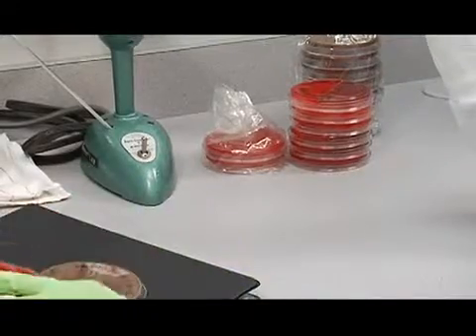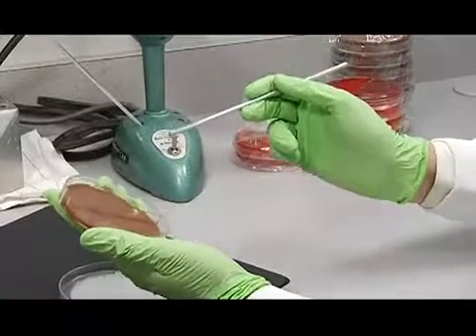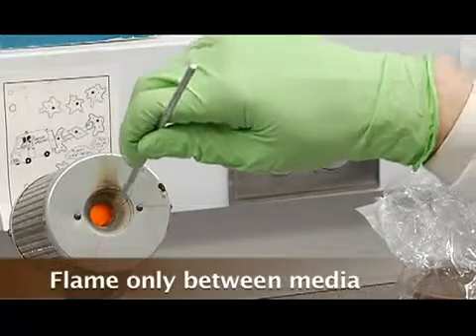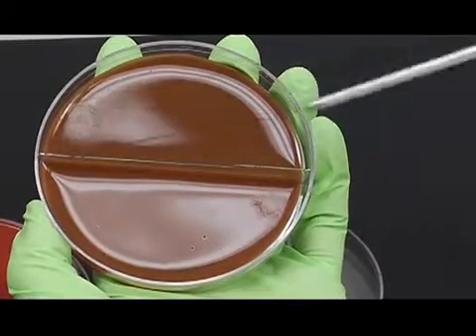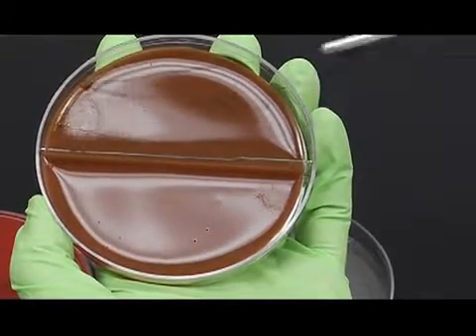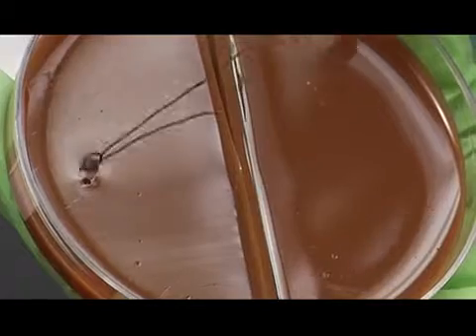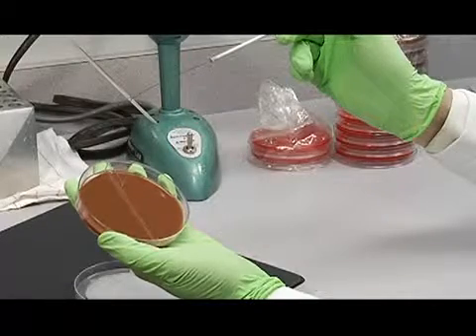Okay, after streaking the blood agar plate, then we'll streak the chocolate agar plate, which is on this side right here. So you can see the inoculum there. We're going to flame our loop. So flame between the media, but not between areas on the particular media. So then with a sterile loop, we're going to streak across that inoculum here. And then one swipe out here into this area of the plate, and then we're going to streak pretty much parallel to the divider like this, going out to the edge of the plate each time.